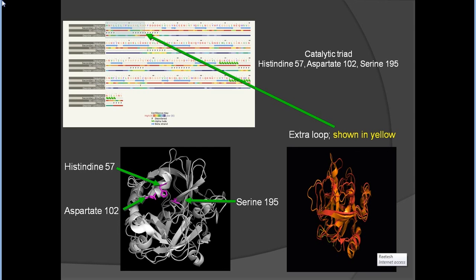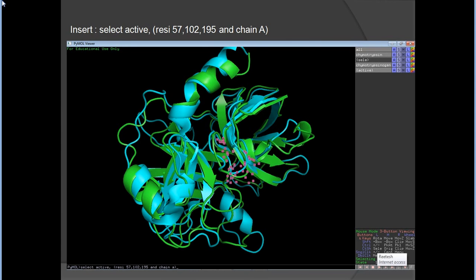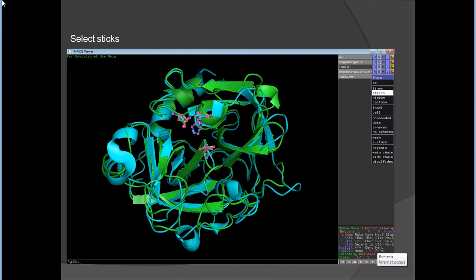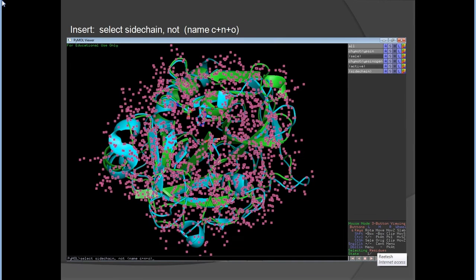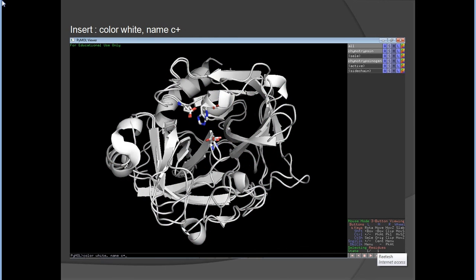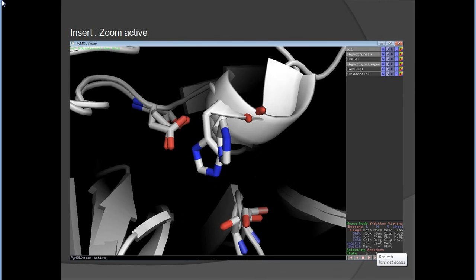To make a video, you need the files in GIF format, so convert the PNG files to GIF format using the program with the 'action view' and 'unfreeze' commands. To select the active site residues, type 'select active, (residue what you like) and chain A'. After selection, show as sticks. For the side chain, excluding carbon, nitrogen, and oxygen, type the appropriate text. To color white by element, type 'color white, name C+...'.